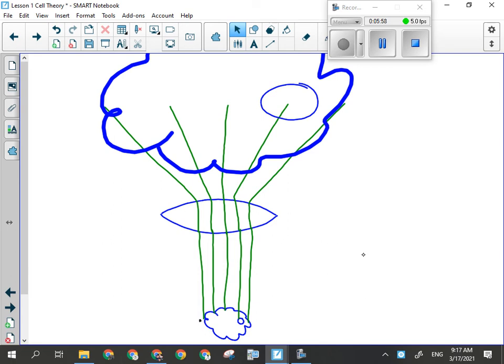Okay, this is called, where did I lose the time? You said you flipped it, but it is the same. So this little thing here, it was on the top of this before, right? And what a lens does is when it goes through two lenses, the image actually ends up getting flipped over, inverted. It's what we call a real image, so it appears backwards.